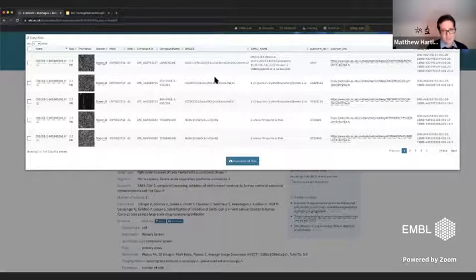And this metadata differs from accession to accession because different types of imaging experiment really have different requirements. If this was a genetic knockout screen, it would make sense to describe, for example, the genes that were being knocked out. If this was a cross comparison looking at multiple organisms, this would explain what the different organisms were. And there is quite a lot of information here. In this case, we have things like Unichem links, again, because it's relative to the compound. We have formulae, and this information can also be searched.